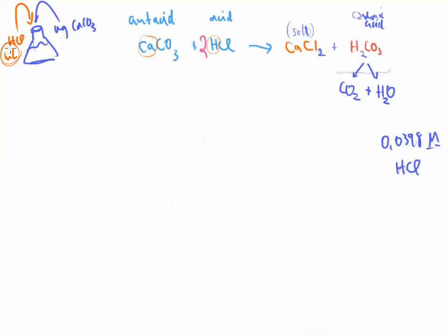And the purpose of us adding the acid was to neutralize all of the base that was in that flask and make this thing acidic.